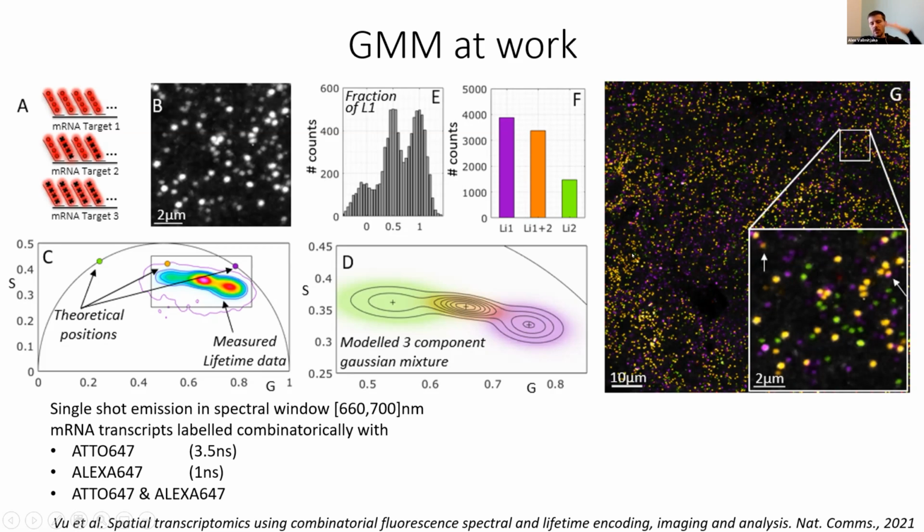This is actually a 3D Z stack, so I'm just showing the projection as you project down. But for example, here, these 2. This one marked here is actually 2 that are very close. So you're getting 2 transcripts that are so close that they are overlapped, and then you start to see uncertainty in your data. And this goes to the second half of the talk, which is about mixing this data.